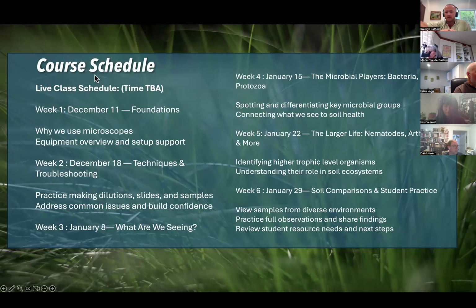The schedule is, we start December 11th with the foundations. Week 2 is December 18th, where we really dive into the techniques. Week 3, January 8th, we start really diving into the organisms. Week 4, we wind up more with bacteria and protozoa. Week 5, we go higher on the soil food web chain and dive deeper into nematodes, arthropods, and more. And then week 6, we really dive into the qualitative analysis, doing soil comparisons and student practice, and learn how to effectively use that when looking at samples.